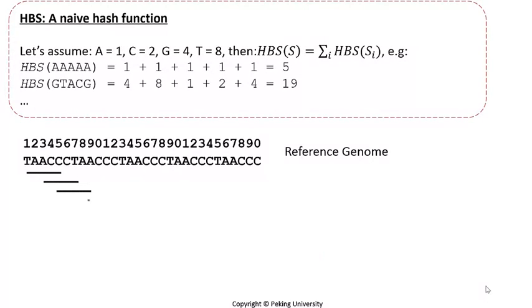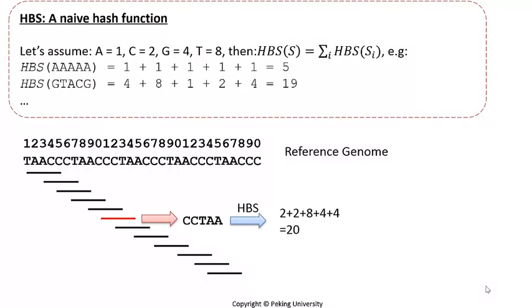For example, given a genome sequence, we can divide it into several seed fragments as BLAST does. Then we compute for each seed the value of hash function as its address in the index table. We will record in the address table this sequence and its locations in the genome. In this way, we can quickly locate any seed in the genome when it is found in the read.